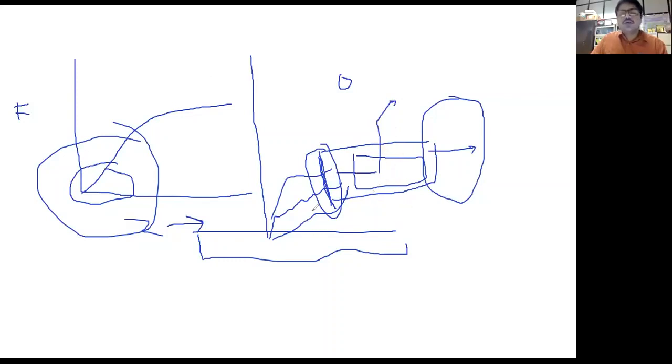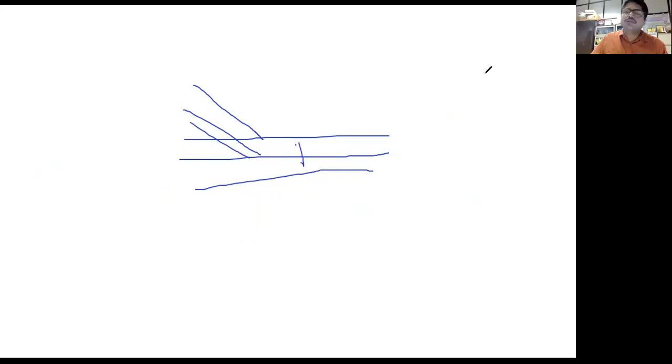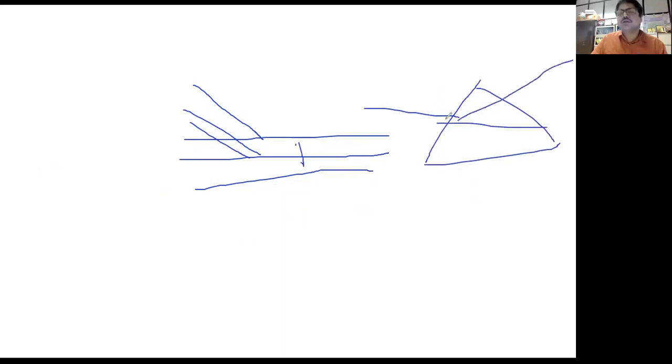So the most efficient process is basically wavelength dispersion. In wavelength dispersion, if you have a collection of X-rays, you use simple Bragg diffraction. So if you use Bragg diffraction and take a single crystal, it works like a prism. A prism will just split, right? Suppose there is a collection of wavelengths, it will send them into different thetas. So that is the highest resolution way of catching the X-rays.